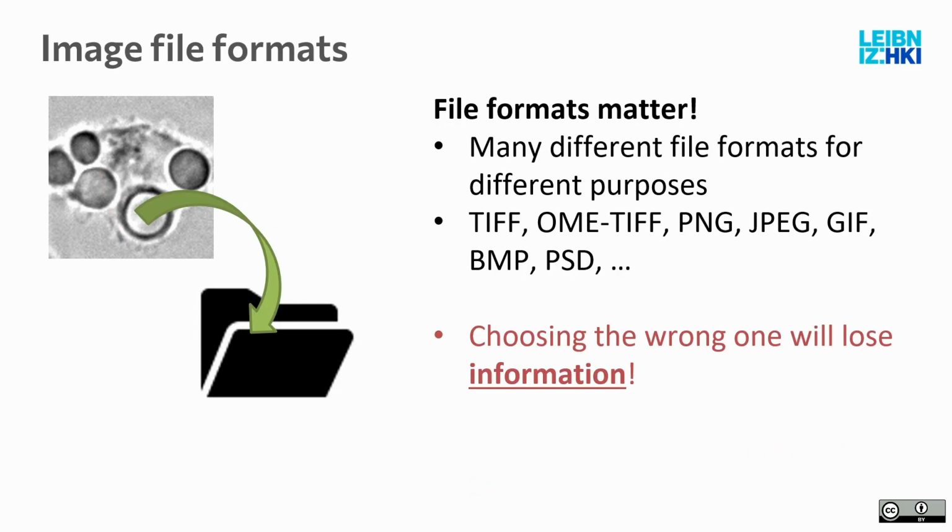And that's why this makes it very complicated, because there are many file formats around that you can choose later on. You find everywhere TIFF and OME-TIFF and PNG and JPEGs, and people use GIF files and then bitmaps and then Photoshop documents and so on. Again, to emphasize, if you choose the wrong one to convert to because it looks nice and small, you will lose information that is then gone, especially if you did it to the original file. In the image analysis you can sometimes do something, but it's not hopeful.